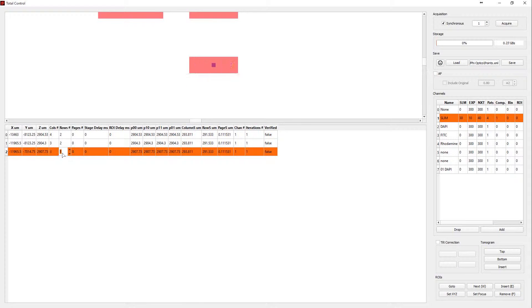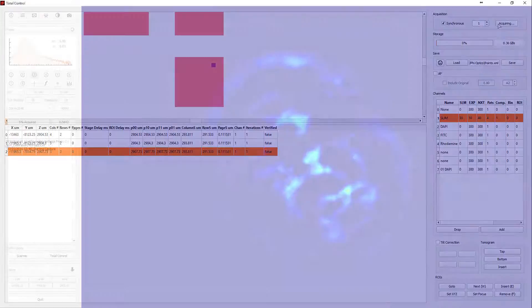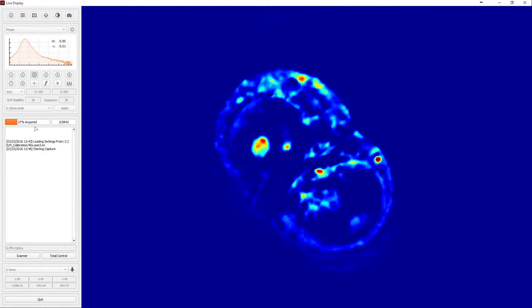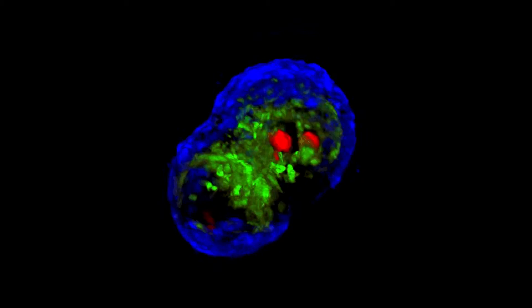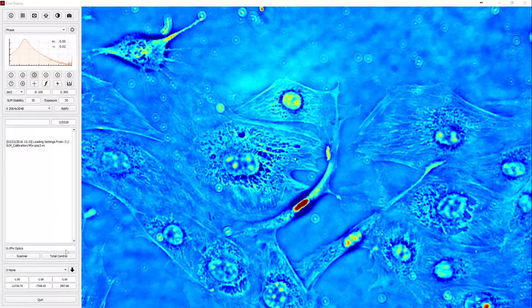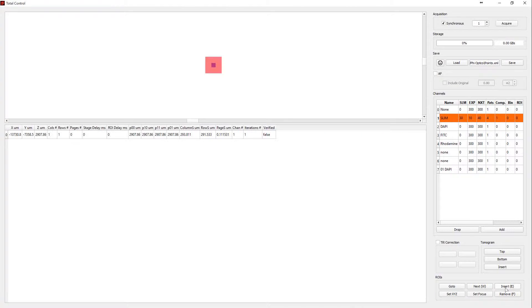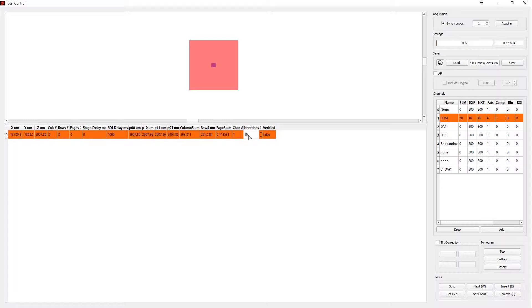You can even do multiple mosaics when imaging a multi-well plate. Or maybe you are interested in doing a Z-stack? No problem! You set the Z-step here and the scanning range, and you are done! What if you are designing a complex experiment that combines several channels of fluorescence, multiple mosaics, Z-stacks, and all these at multiple time points?